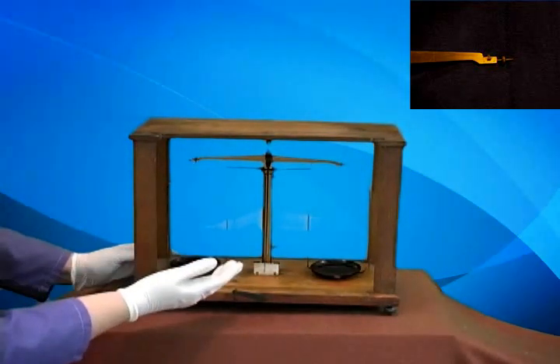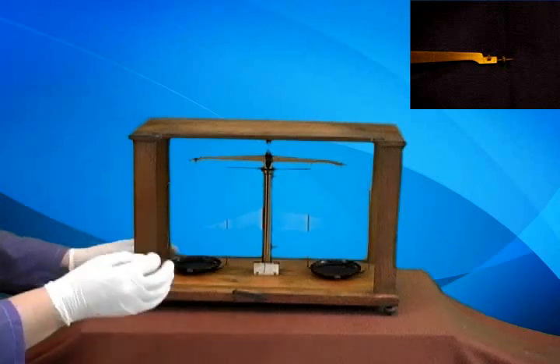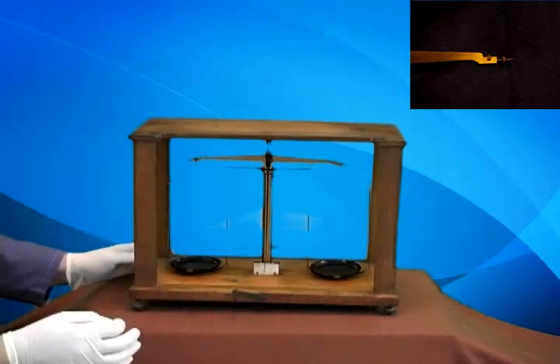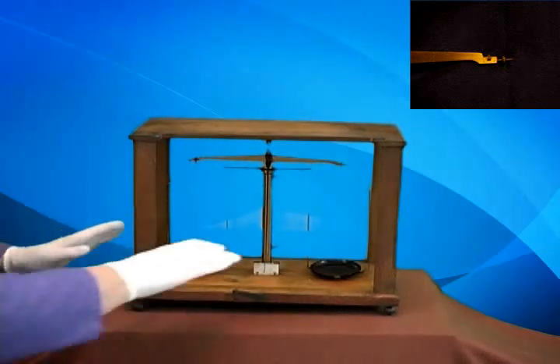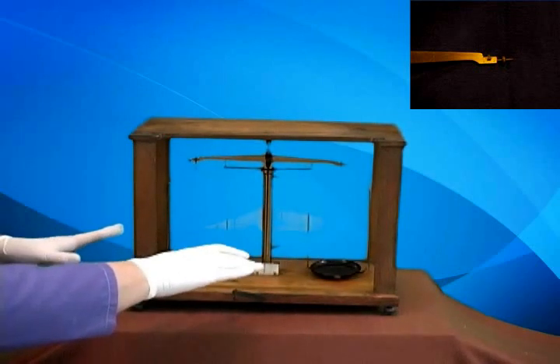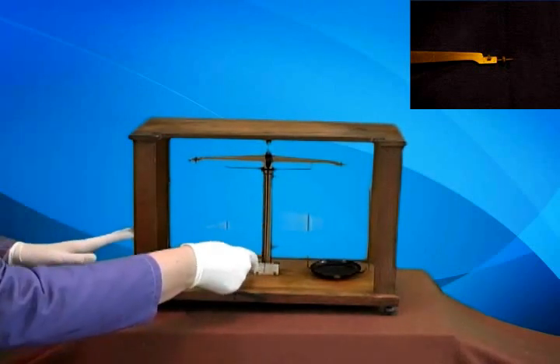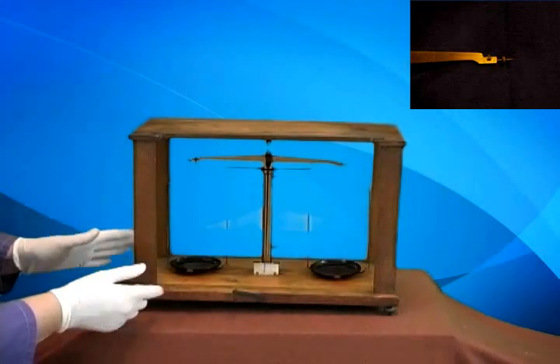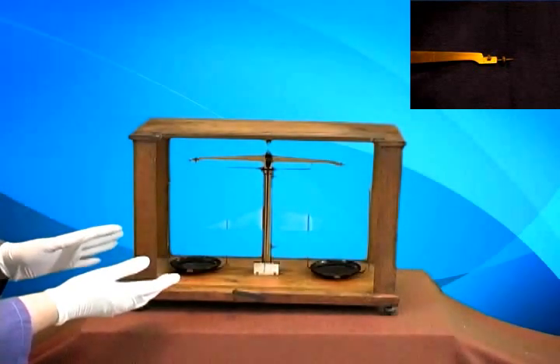Now, one of the first things that had to be done was the balance had to be level. Because if the balance were not level, then the pin would not swing regularly across the front, and the weights would not be accurate.